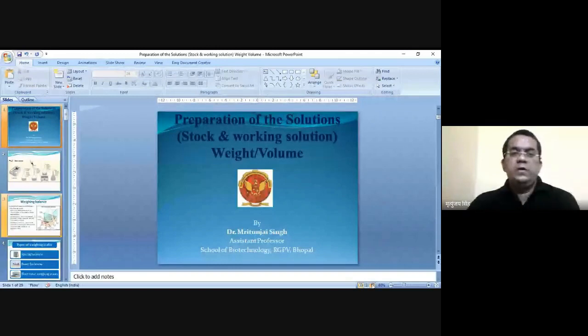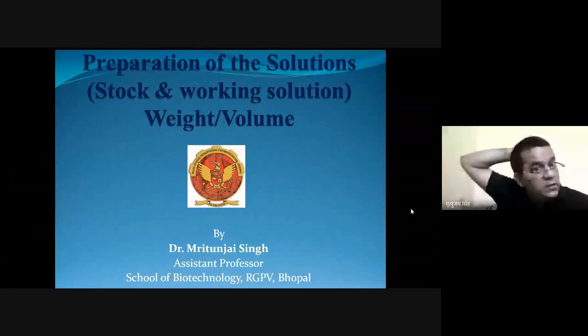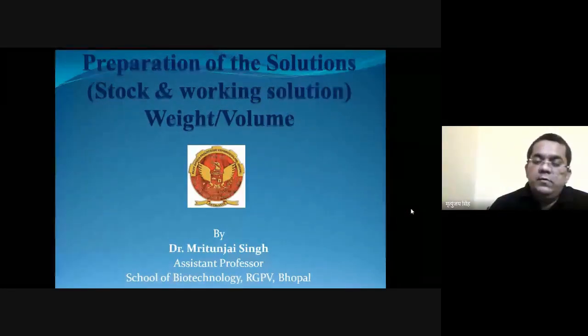Dear participants, a very good afternoon to all of you. Today we are discussing preparation of solutions, that is stock and working solutions. Today I am discussing weight by volume aspects.